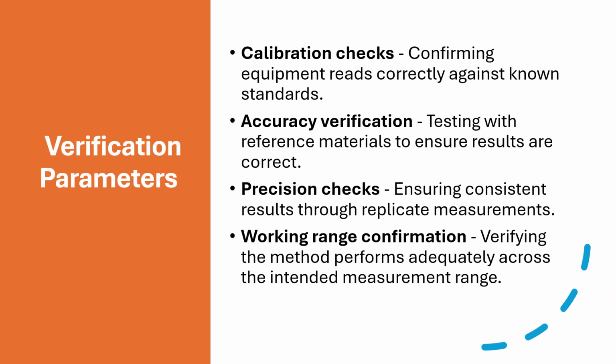Verification is performed more frequently than validation, often as part of routine quality control. While validation might be done once when establishing a new method, verification happens regularly to ensure ongoing compliance.